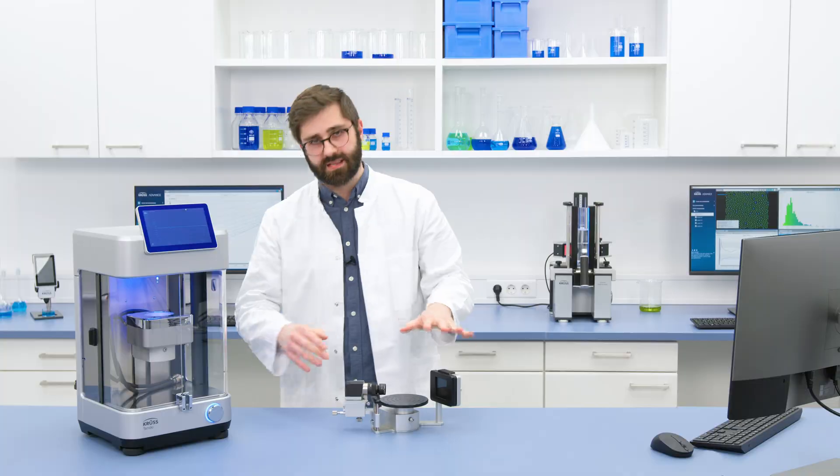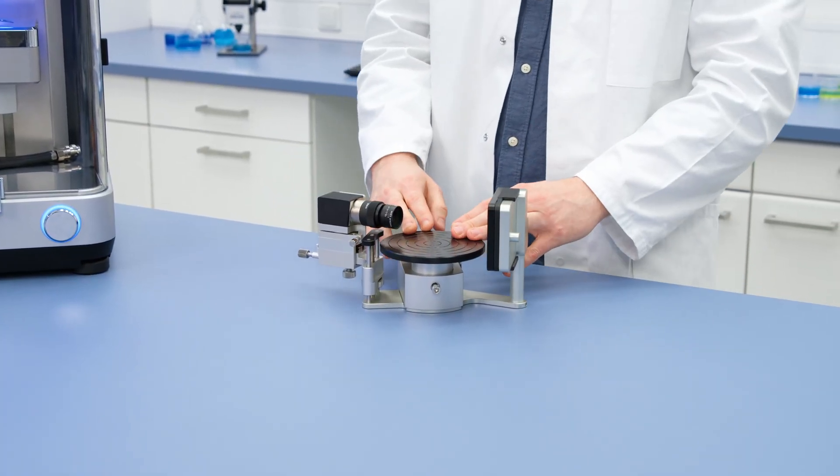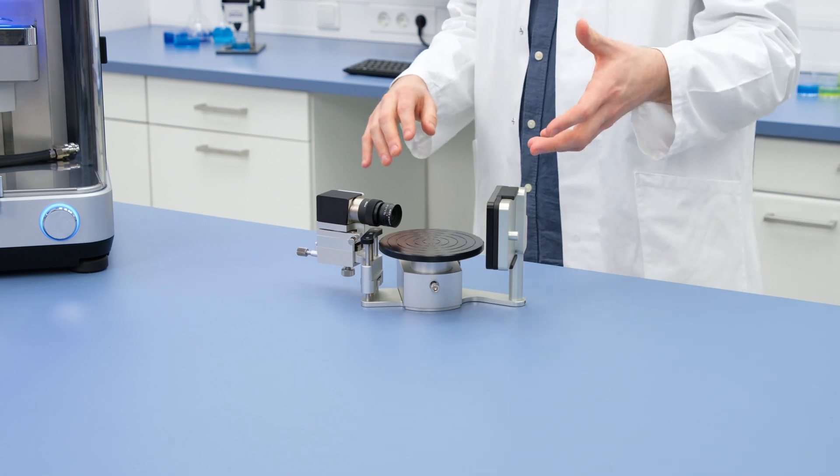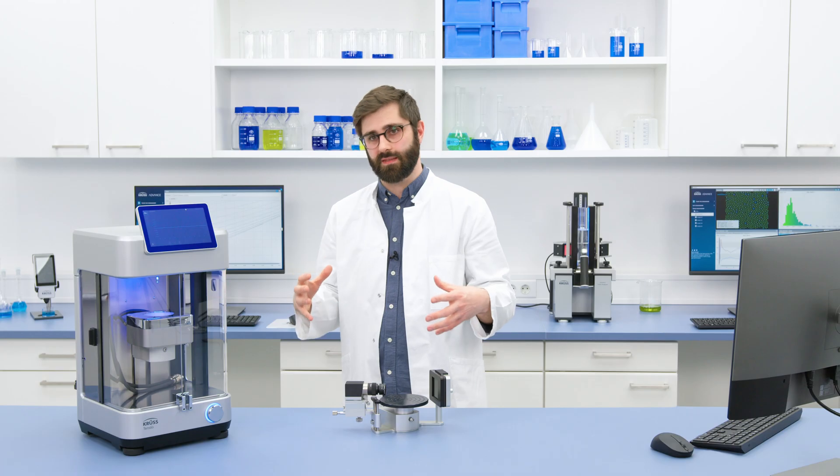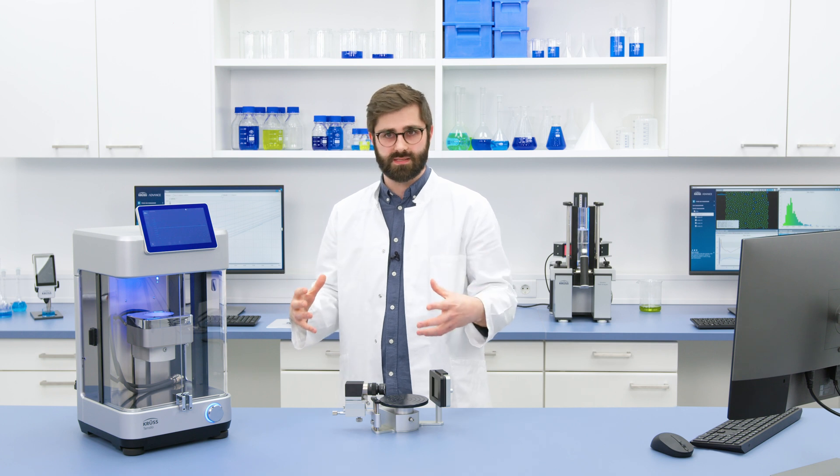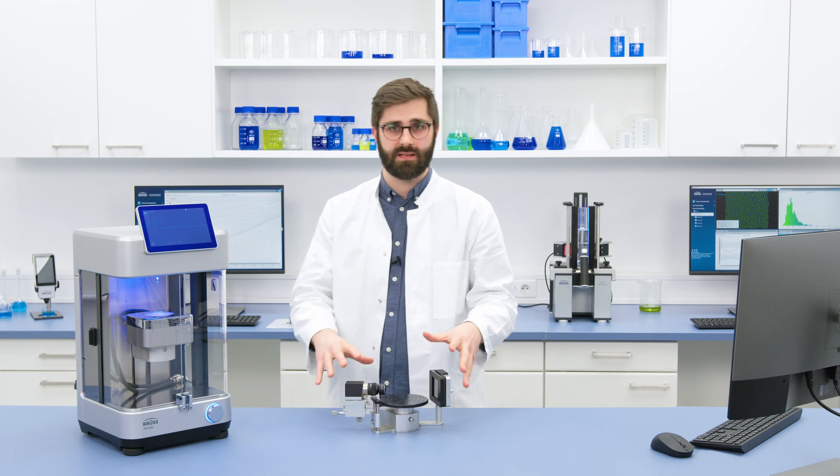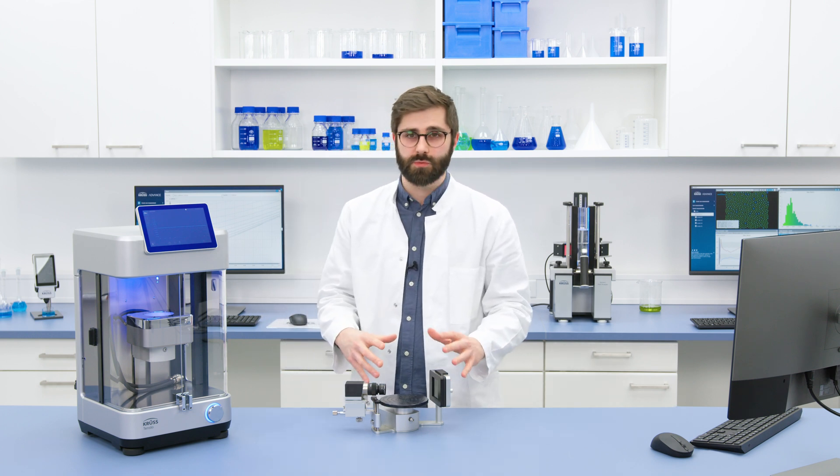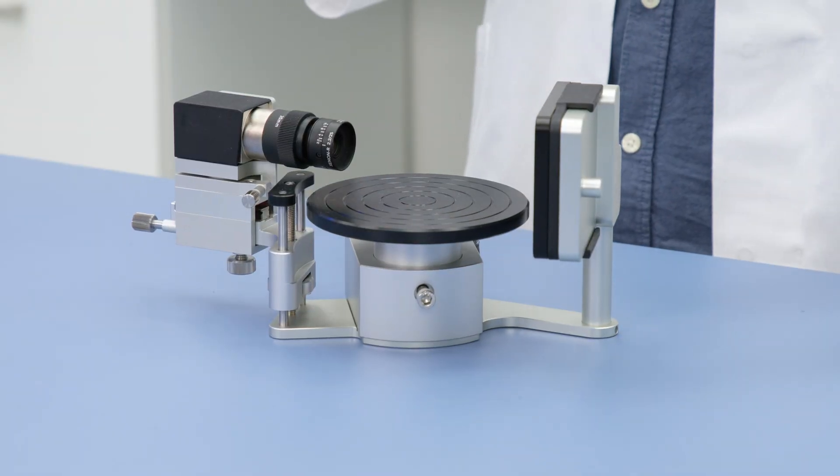So this is a camera module for Tensio, where we have a camera and a light source combined with a sample table. And this is a pretty exciting innovation because this is the first time that Kruse has brought together the core competencies of optical image analysis and force-based analysis, and this opens up a whole new range of possibilities for Tensio to make all kinds of new measurements.